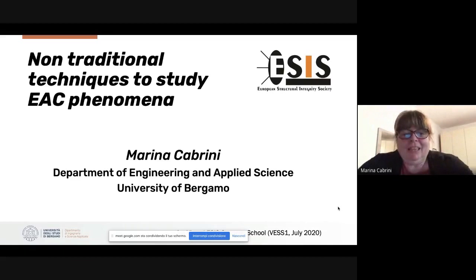Now, I have tried to speak about some non-traditional techniques to study environmental assisted cracking phenomena, with many examples of some laboratory activity that we carried out in order to study the hydrogen embrittlement phenomenon using non-standard techniques.